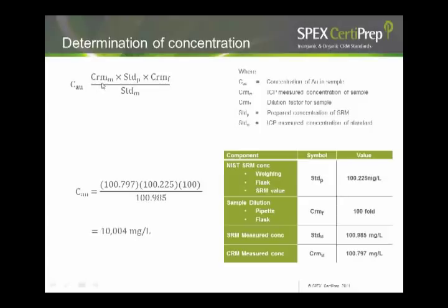Now, these are the additional terms that we used in the preceding chapters: combined uncertainty and expanded uncertainty. These are all the important concepts in calculating the uncertainty for the process that I'm going to describe. So far, we have outlined the theory behind the calculation. Now, how do we take a practical approach to this?